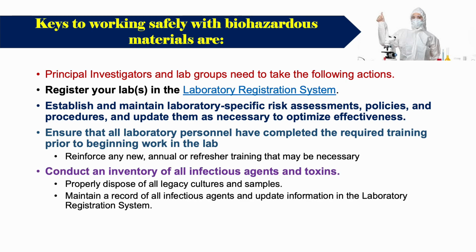And they must conduct an inventory of all infectious agents and toxins. They must properly dispose of all legacy cultures and samples, maintain a record of all the infectious agents, and update information in the laboratory registration system.